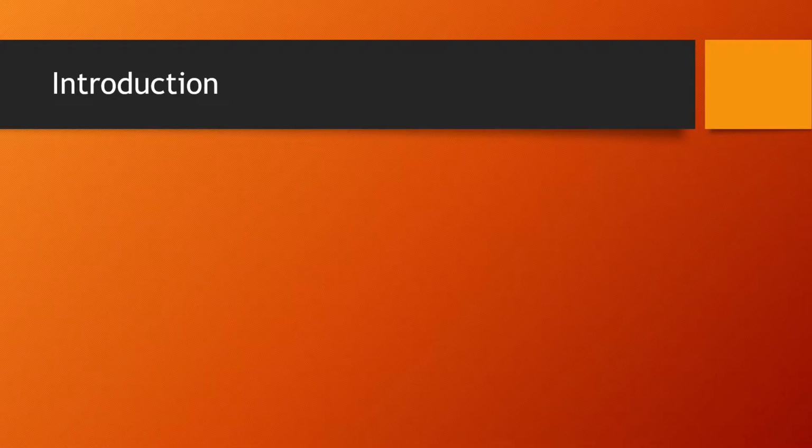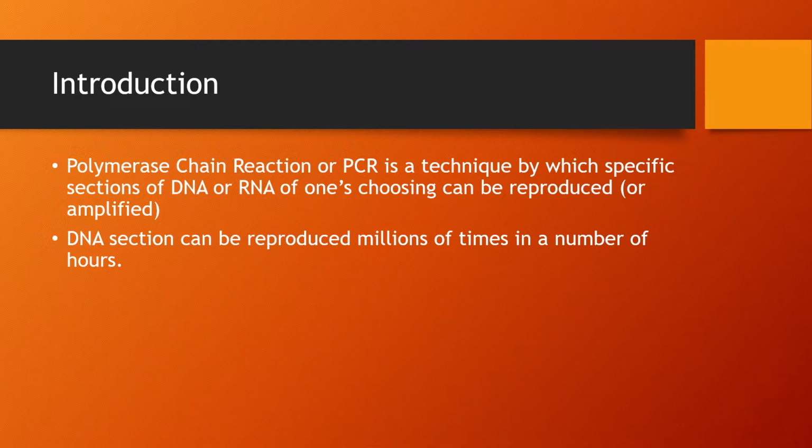Before we get into the depths of PCR, let's have a look about what PCR actually is. Now, PCR is a technique used by a wide variety of geneticists and scientists who wish to study a specific section of DNA or RNA.